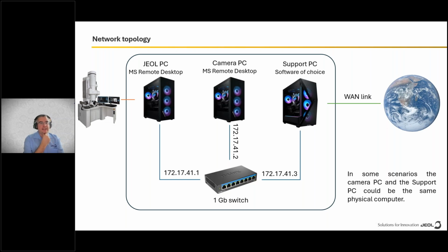Now, if your IT department is not that cooperative, there are other ways to solve the problem. This is not something that I personally or we as JEOL encourage in any way. But I remember solutions where a customer wanted to plug in a GSM adapter with a SIM card into a support PC to bypass the departmental IT regulations. That was not encouraged and it didn't end well.